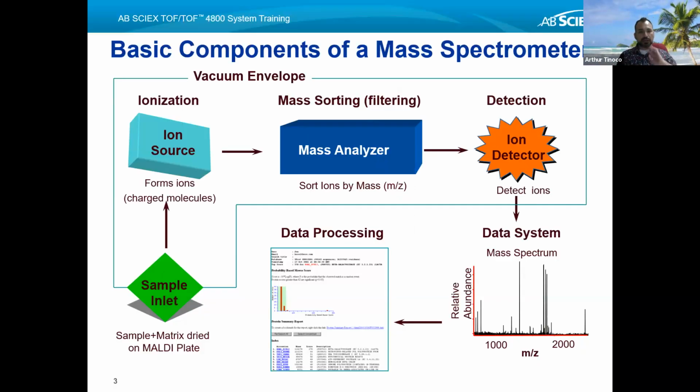All right, so let's get a context of what exactly is going on within this instrument. What you're going to have is a mixture of your sample of interest with a matrix. We're going to define in a bit what you have to consider as far as the choice of matrix, because you have to be very familiar with the samples that you're collecting. This is the reason I've been communicating with the REU PEER CLIMB students, to let me know what samples they're going to have and to be very particular about the prep of the samples.